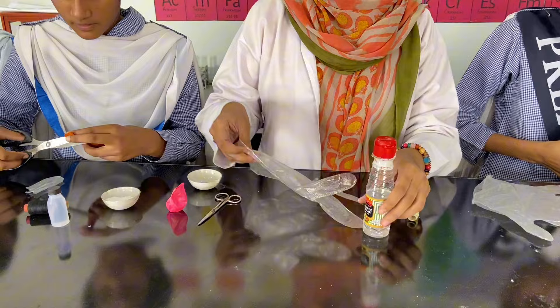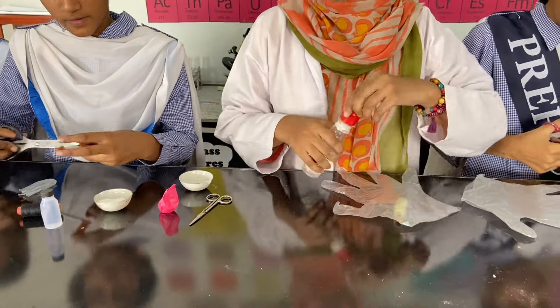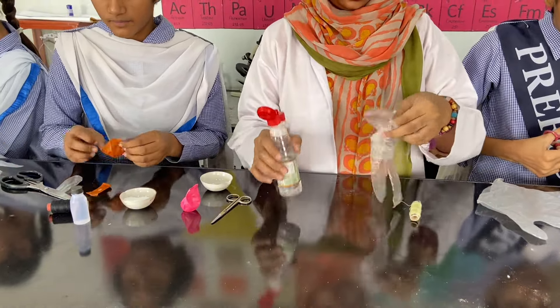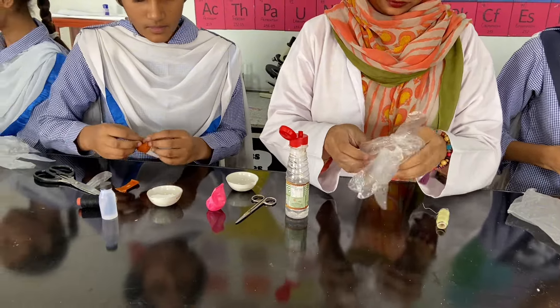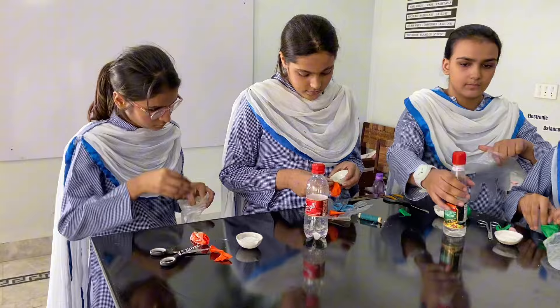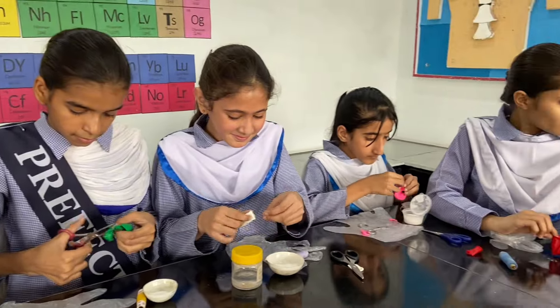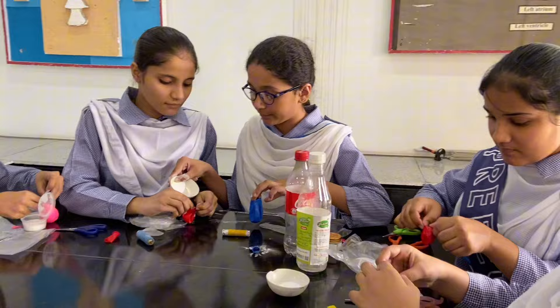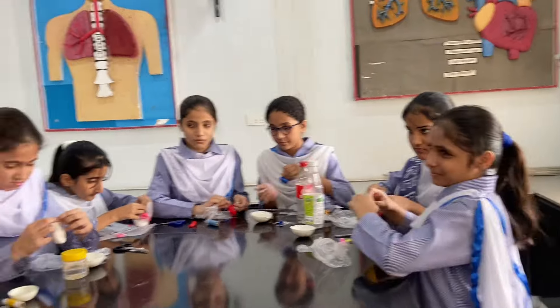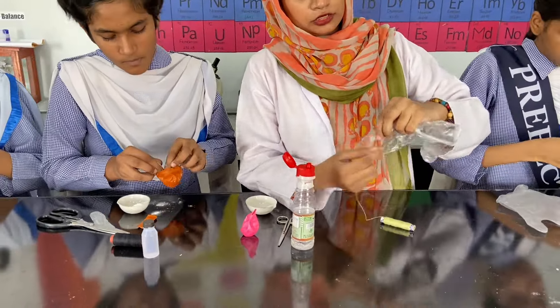On the other hand, we are taking a small amount of vinegar inside one of the fingers of our glove. Now we are tying this vinegar with the help of a thread so that no vinegar will come out of it.